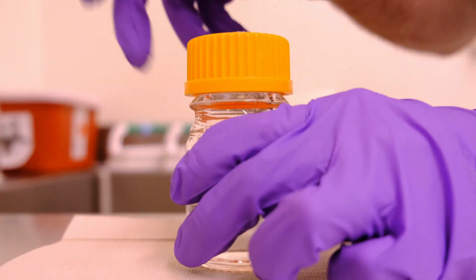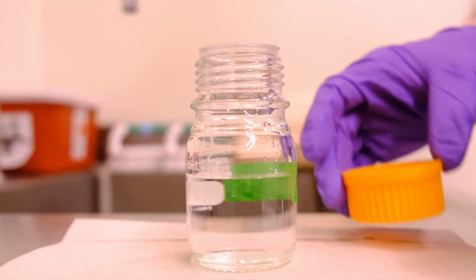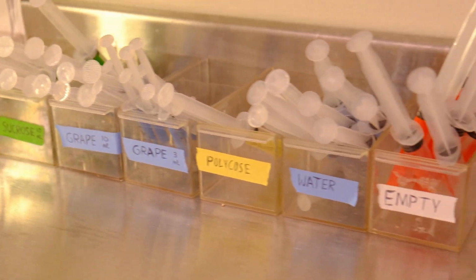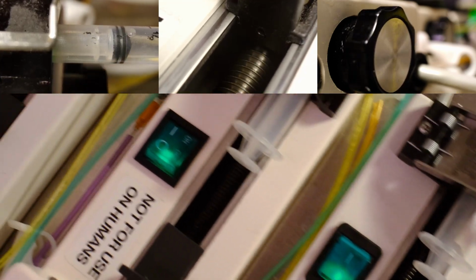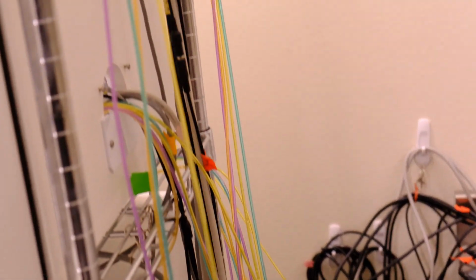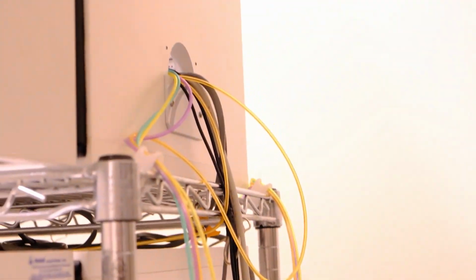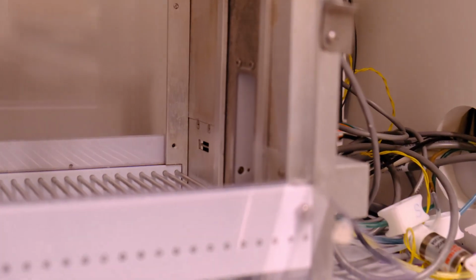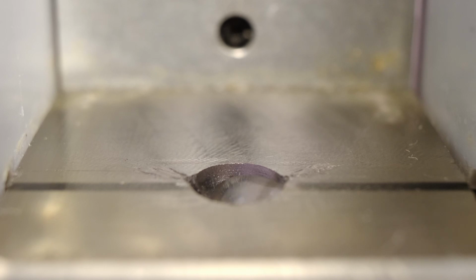The sugary liquid we use is a simple solution of sucrose and water, but we may use other sweet solutions in our lab as well. The sweet solution is squeezed out of the syringes by these pumps, which carry the liquid down thin tubes and into the Skinner boxes. The liquid arrives inside a magazine on the right side of the box and fills a small food cup.